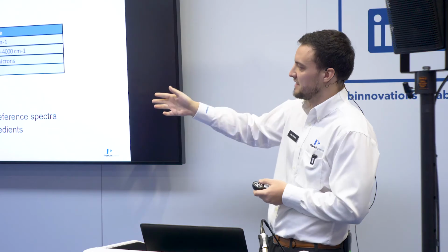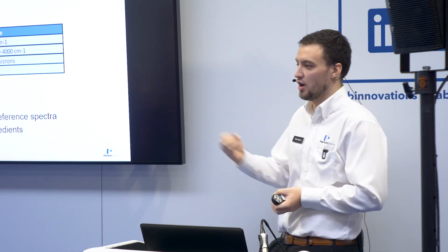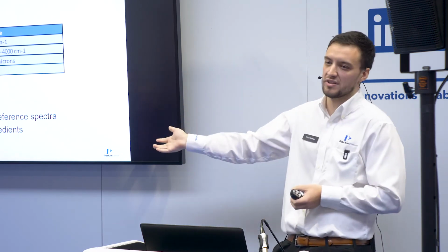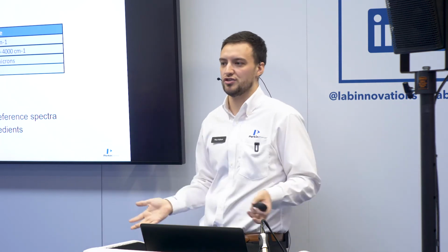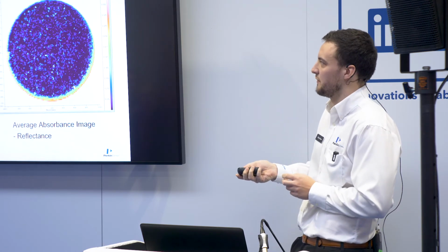samples, and our data analysis then, basically from what we gain, is we're going to have two scenarios. The scenario where you have your known ingredients, so you know what API you are using, so then you will most likely have reference spectra for this. And then the other one is having no prior knowledge of your sample at all. So we have two scenarios that I'm going to go through.